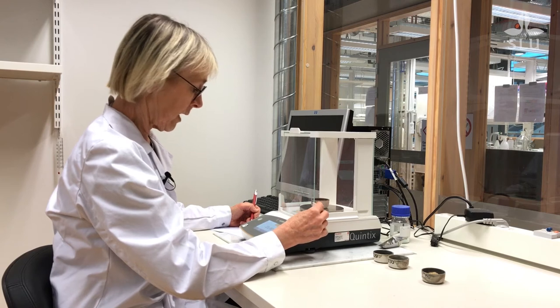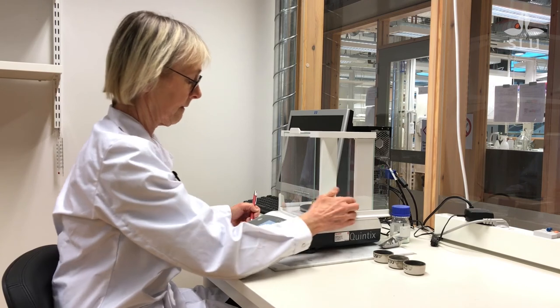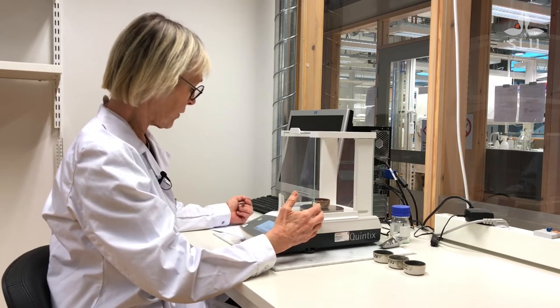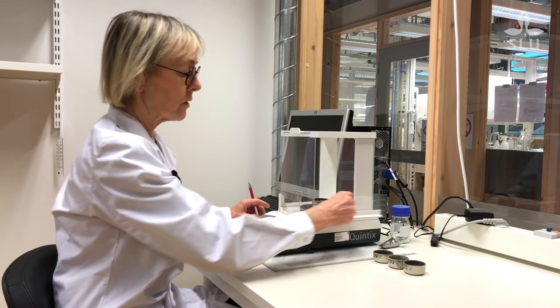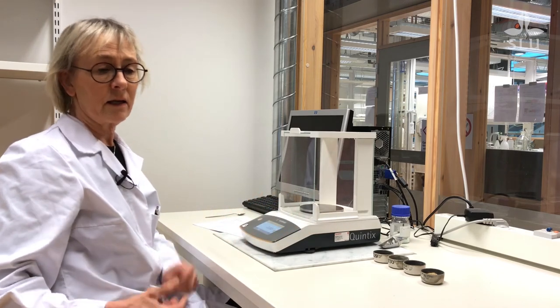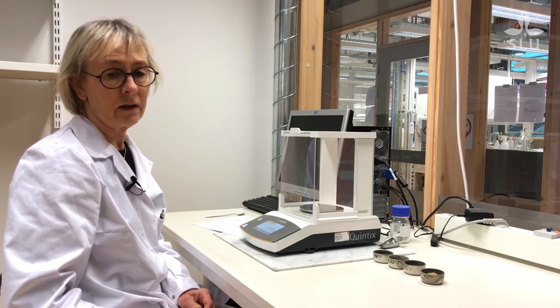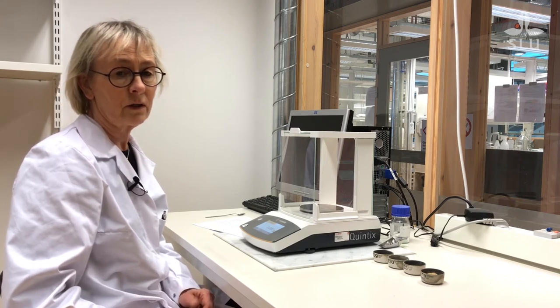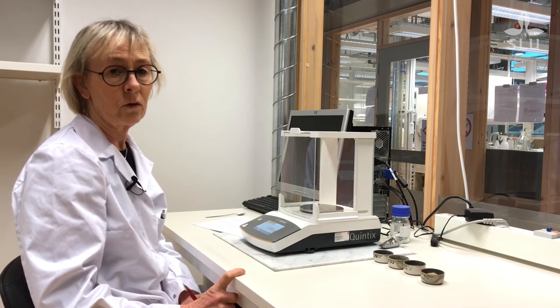And this one as well. And the last one — it's also about 40 milligrams heavier than before. So by showing you this, I think you understand that if you use these weights for calculating the dry matter, you will get a different result. And this result will affect all your analysis since you are calculating them on the dry matter basis.